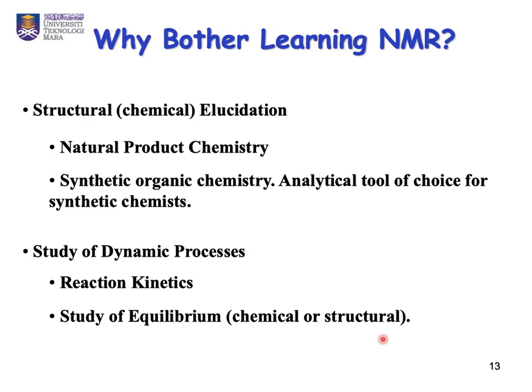The question arises, why bother learning NMR? NMR spectroscopy helps in various fields of chemistry as well as biochemistry and other fields. It helps in structural elucidation in the field of natural product chemistry and synthetic organic chemistry, in order to find out the structure of the molecule.